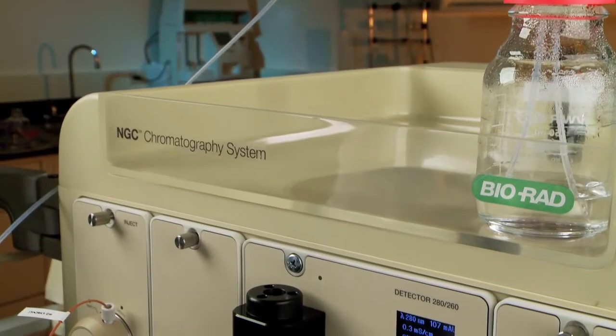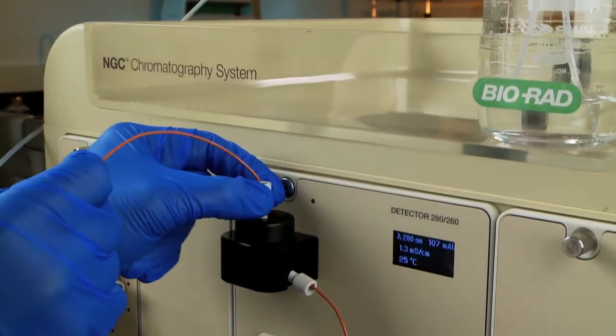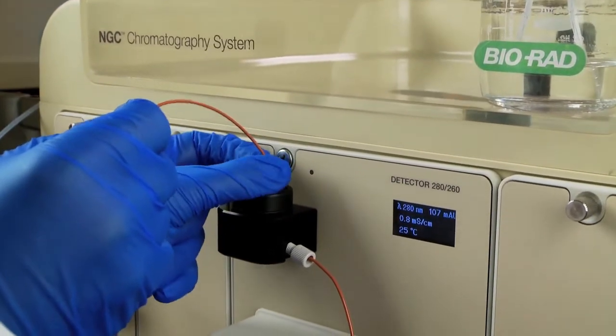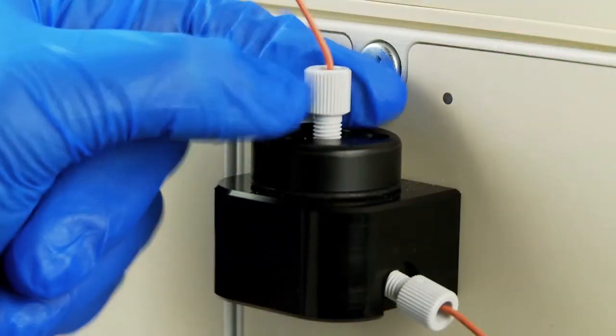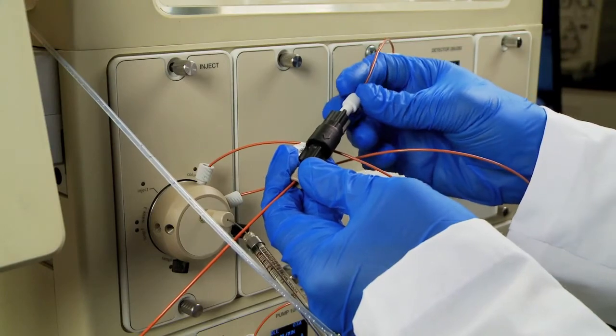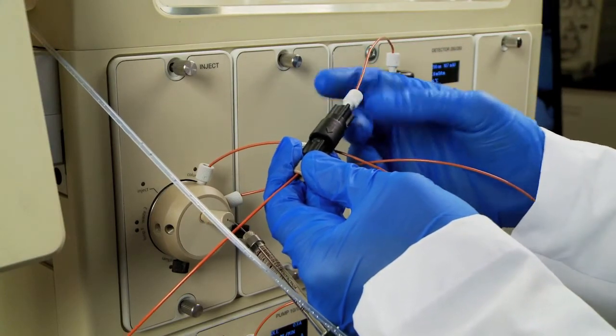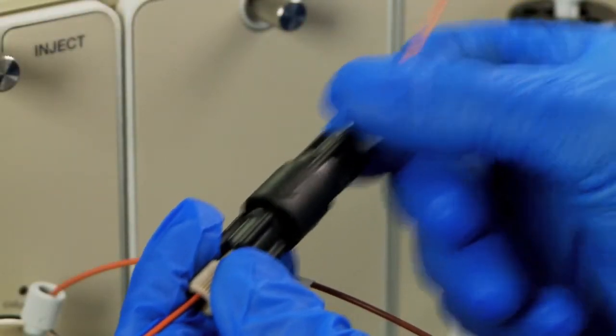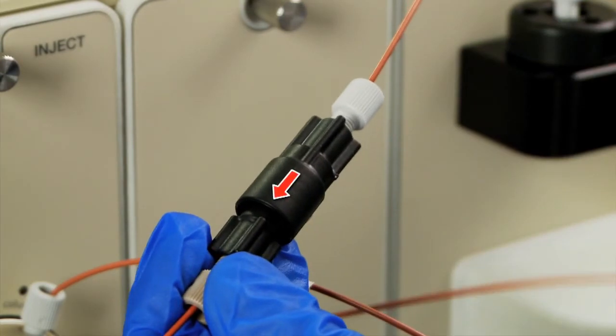Finally, you will attach the outlet tubing and back pressure regulator. Connect line number two into the top of the conductivity monitor and then connect the other end into the 40 psi back pressure regulator. The arrow on the body of the regulator should point in the direction of flow.